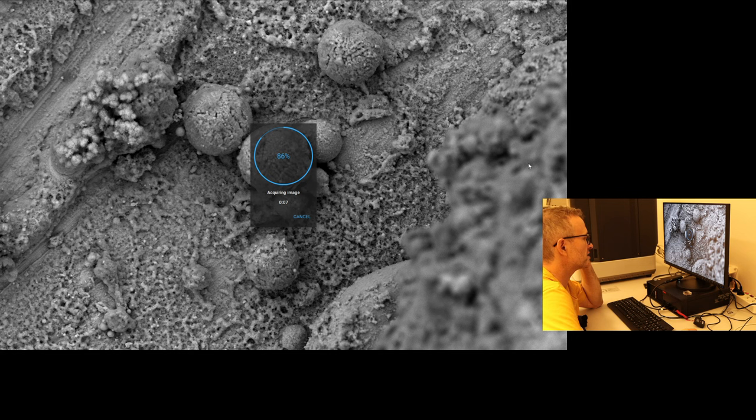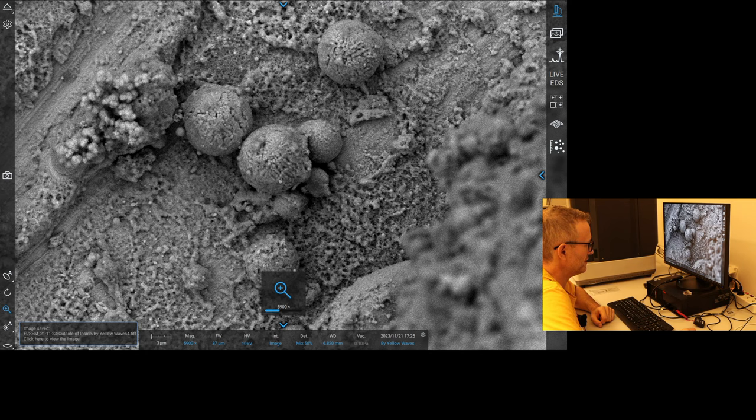Much dirtier than the previous one I looked at. Good thing is they look like they're well fused in there, so hopefully they won't jump about when we up the beam energy here. Everything's pretty much of a muchness, which means in this area it's really mixing the things together. The different elements, very dynamic area.